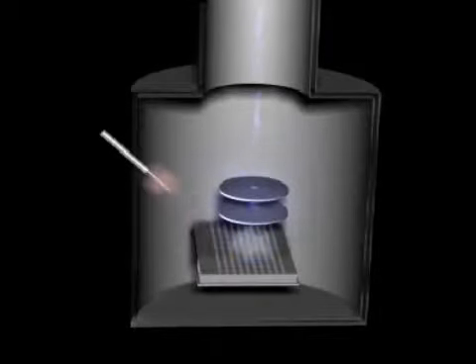In the initial ionization step, they're bombarded by a laser. The sample molecules vaporize into the vacuum while being ionized at the same time.